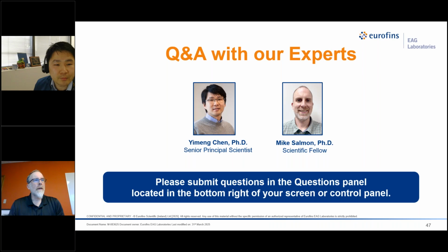Okay, great. Another question that came in was, you mentioned an artifact with peak overlap in your mass spectra. How do you deal with these overlaps? And then what kind of advice do you give to folks that are just starting out in APT?